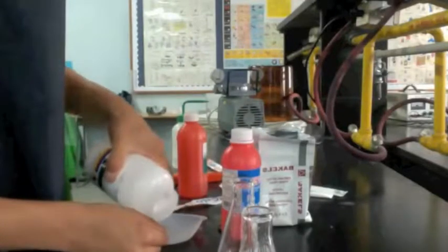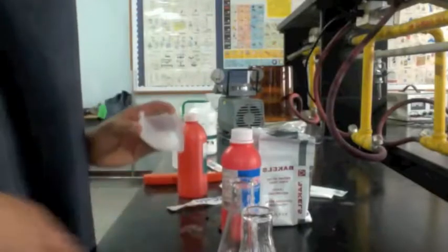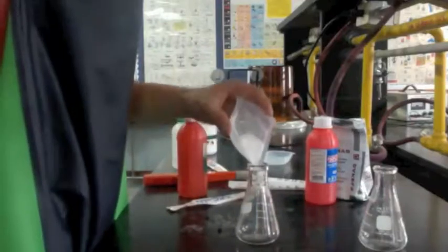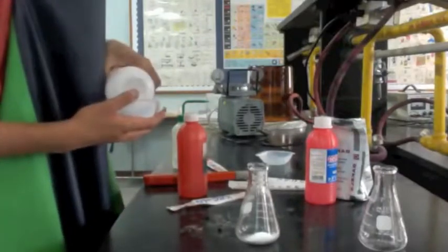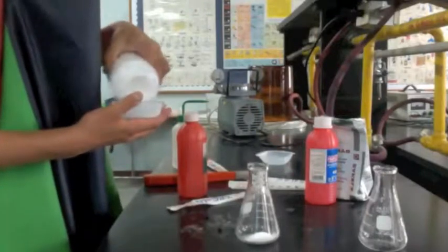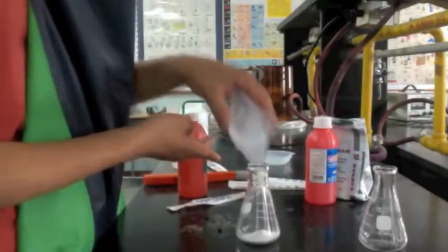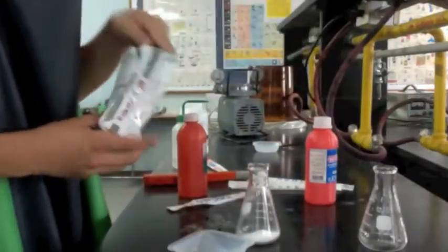So first off, we pour some sodium bicarbonate into one clean weighing dish, and then we put this baking soda into one of the empty flasks, one of the dry, clean, empty flasks. This is the flask that will be producing carbon dioxide. We pour some more because due to previous experiments, we found out that mixing sodium bicarbonate and hydrochloric acid produces less carbon dioxide than the oxygen, which is why we used such a strong acid and more sodium bicarbonate than in previous experiments.